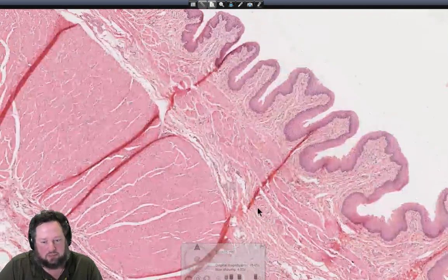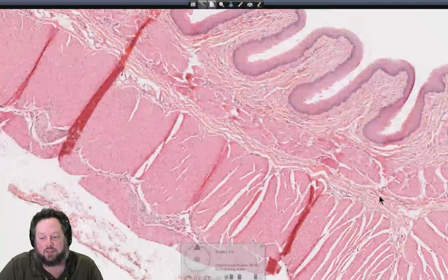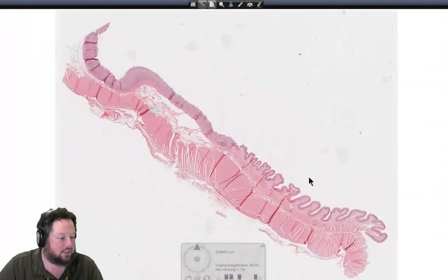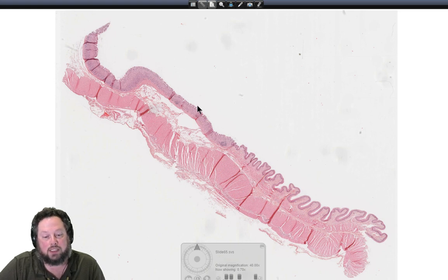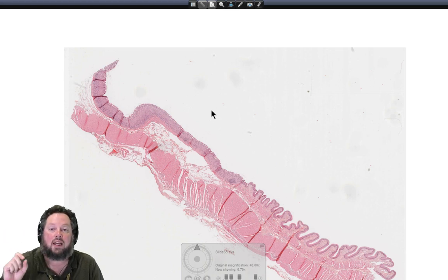I certainly don't own a slide with any of the glands present. But yes, potentially they both could have submucosal glands. And they're the only two sites in the gastrointestinal tract that can have submucosal glands: the esophagus, proximal and distal regions, and the duodenum.